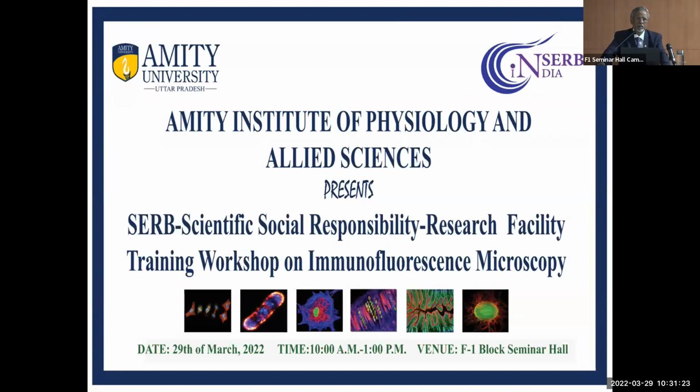The main importance is to locate and detect your gene of interest, your protein of interest, your antigen of interest, and that is possible through this simple procedure. If you have a fluorescent microscope, there is a filter change also. You can have different colors and you can have contrast. But the problem comes with quenching. If you stain, some of the stain quenches very quickly before you take the photographs.